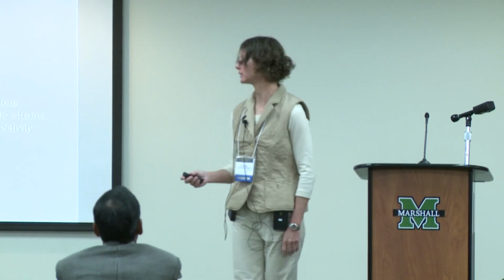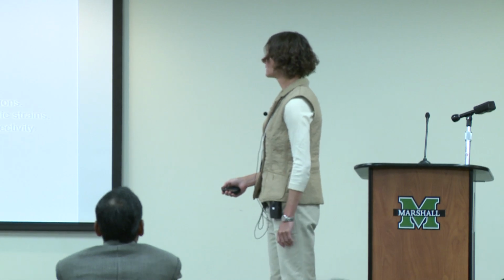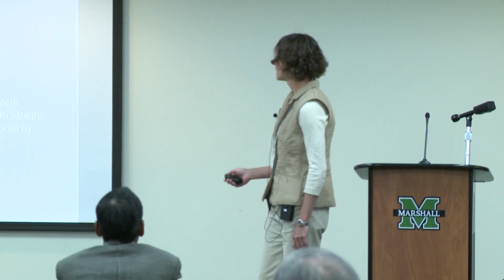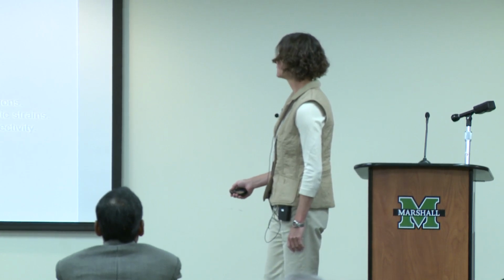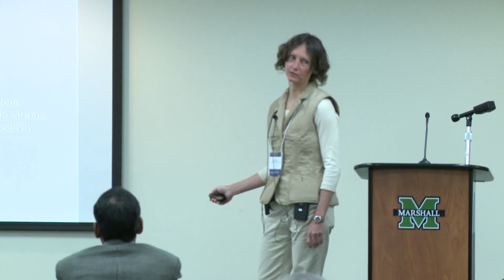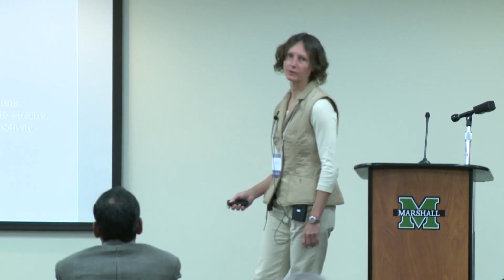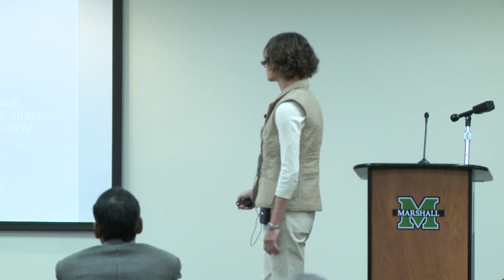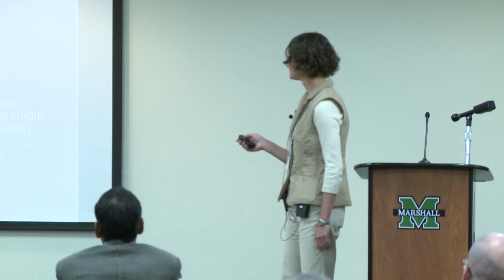and it's not understood why one strain would cause an infection and another strain wouldn't. So our approach is to now sequence the genomes of pathogenic and non-pathogenic strains and see if we can identify genes that are present in the pathogenic organism that are absent from the non-pathogenic strains that are associated with infectivity. So we have teamed up with Dr. Joan E, who's at the Stanford Genome Technology Center, to help us with the bioinformatics of this.